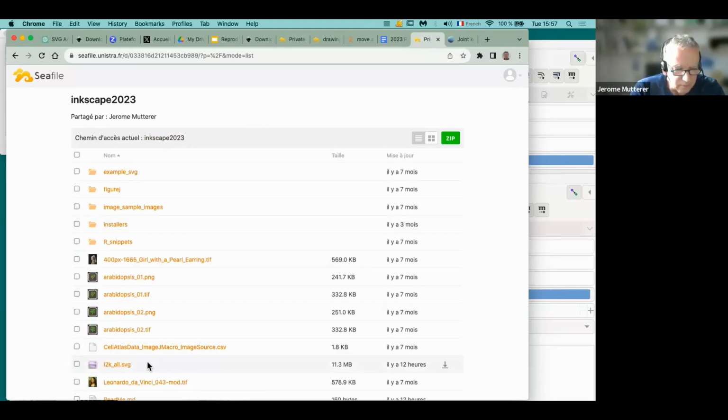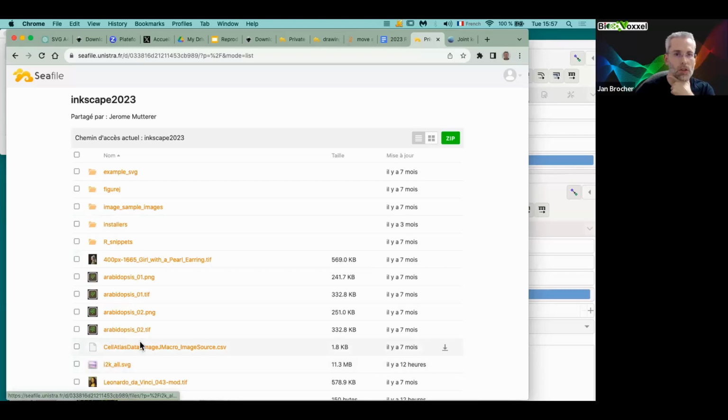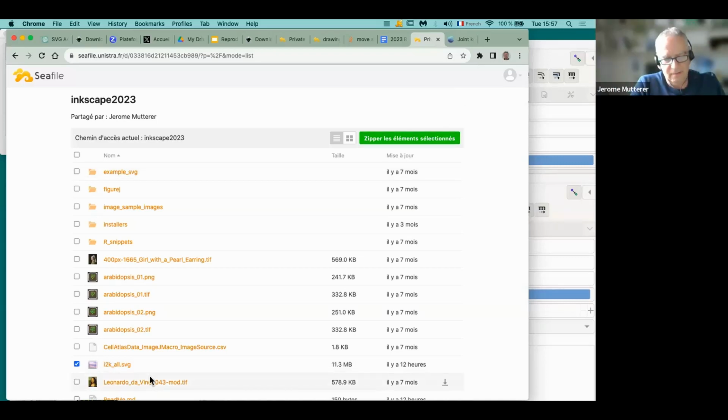Jerome, just to mention that shortly, what you told me, you should mention that this is mainly working just with ImageJ, not with Fiji, right? Oh, yes, exactly. So far, it works very nicely with ImageJ. Some people added working with Fiji as well, but the problem, in my opinion, is that Fiji takes a long time to start, and then it's a little bit boring when you wait for your input.